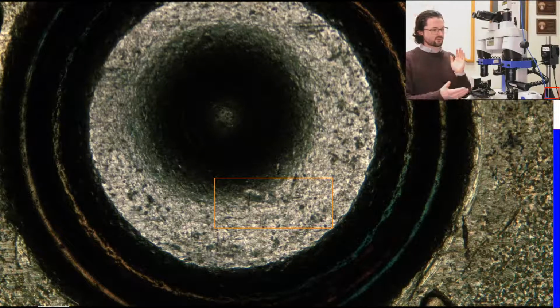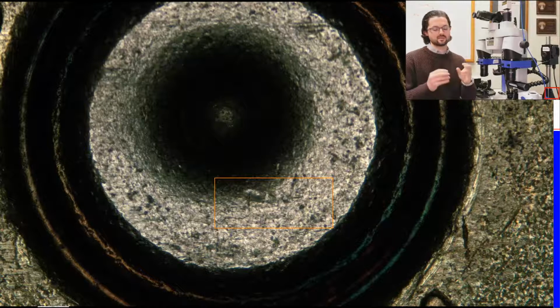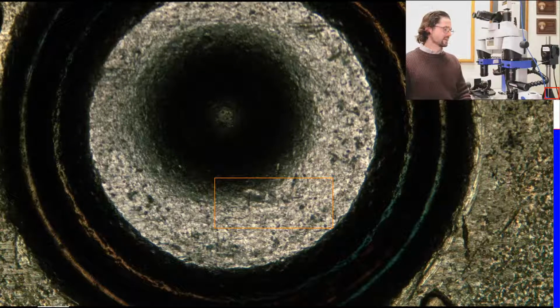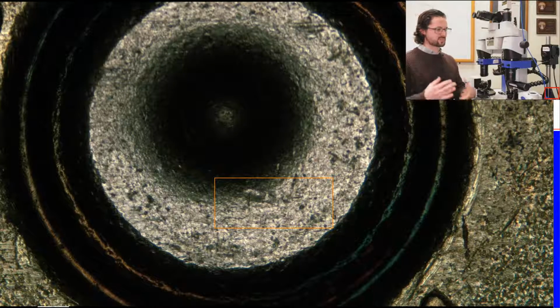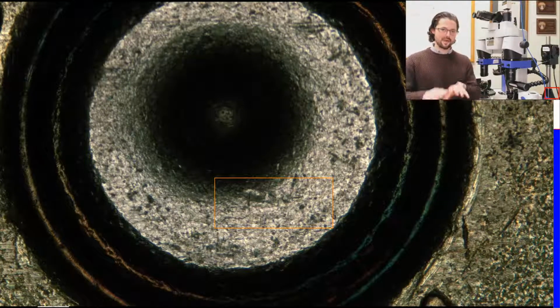It's designed for granular breach face marks. It's really good for that. It's also really good for items that have a lot of specular reflection, like mirrored surfaces. Yeah, it can be really helpful, particularly if you have random chaotic patterns and you're trying to match granular patterns, you can use the coaxial kit to help match those patterns.